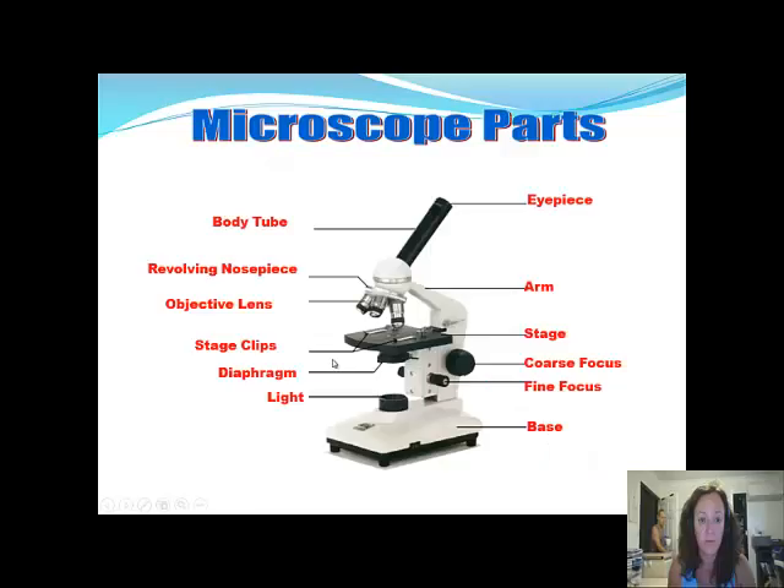Let's have a look at the different parts. This is the eyepiece, which you look down. This is the arm, which is what I recommend you use to carry it.